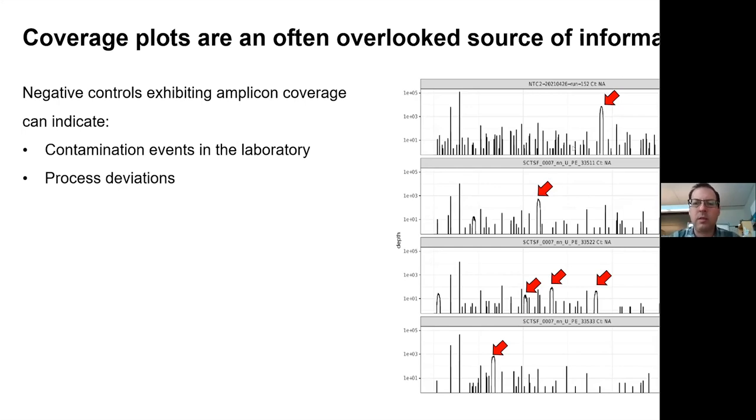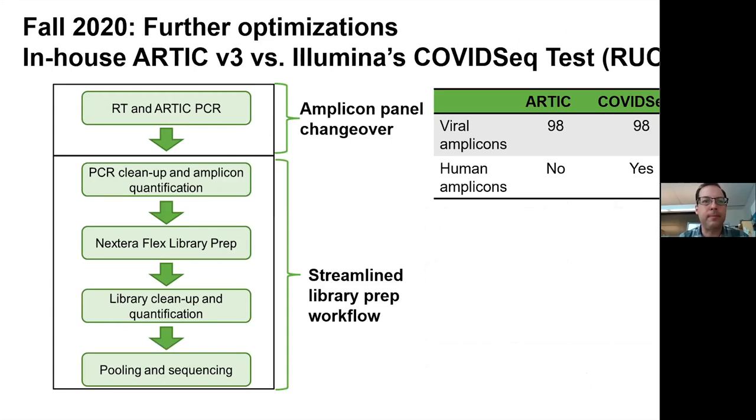So in this case, it's random contamination, but the fact that the sequencing is so high, we went back and saw that the process had changed, and we were sequencing these to a lot deeper coverage than we would have normally, leading to more signal occurring in the NTCs and more reads per amplicon. So we're trying to diagnose things like that with these coverage plots.